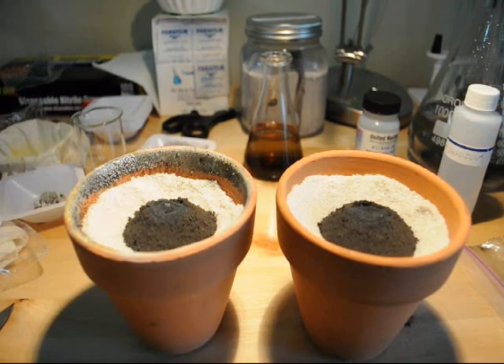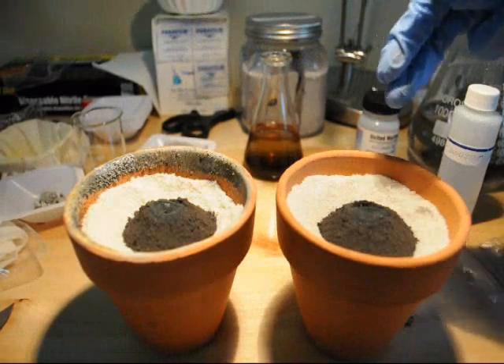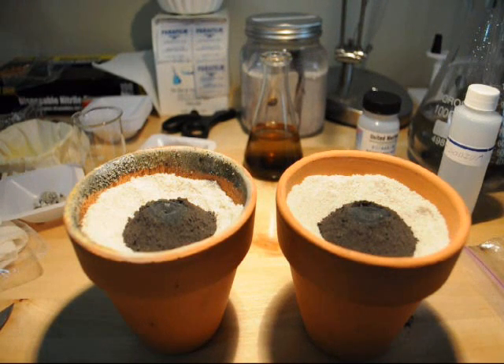To the right batch, I've added 5 grams of potassium permanganate in an attempt to recover more manganese metal from the end of the reaction.